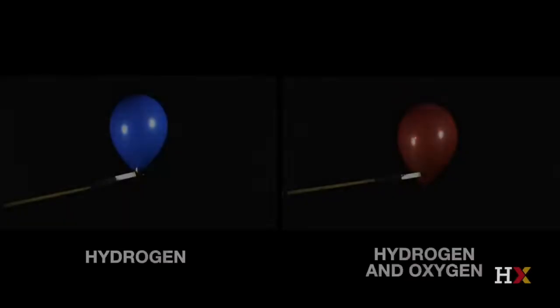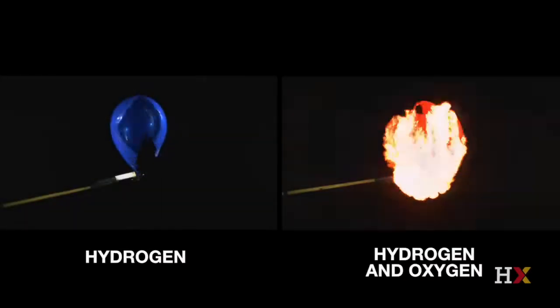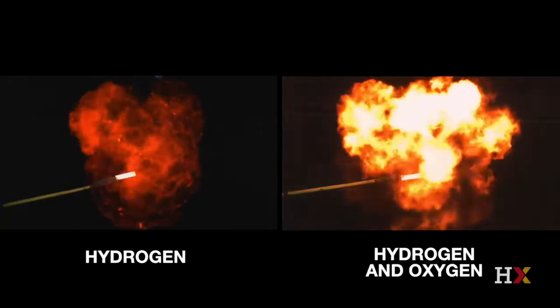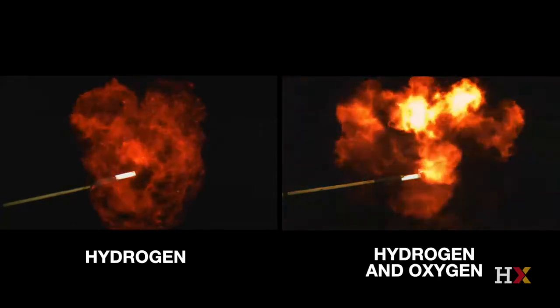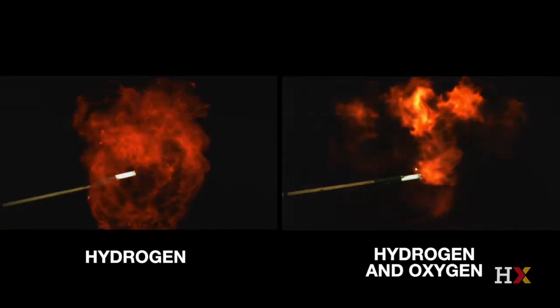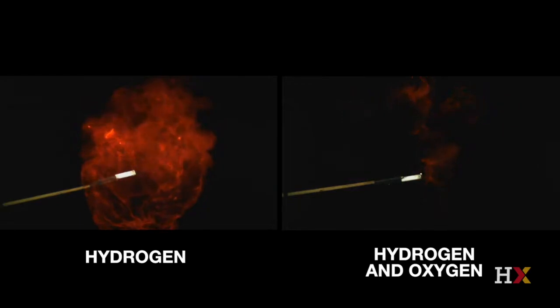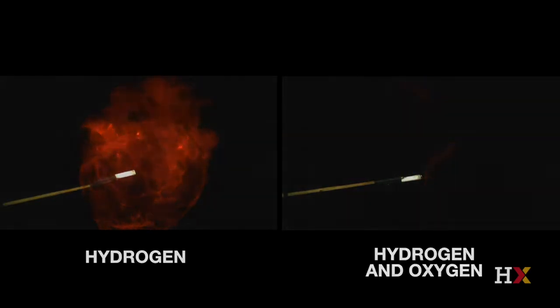If we compare the explosions of the hydrogen-only balloon and the hydrogen-oxygen balloon, you can see that the hydrogen-oxygen balloon explodes faster and produces a brighter flame. Let's compare these 2 explosions in terms of the power of the explosion and the total amount of energy released.